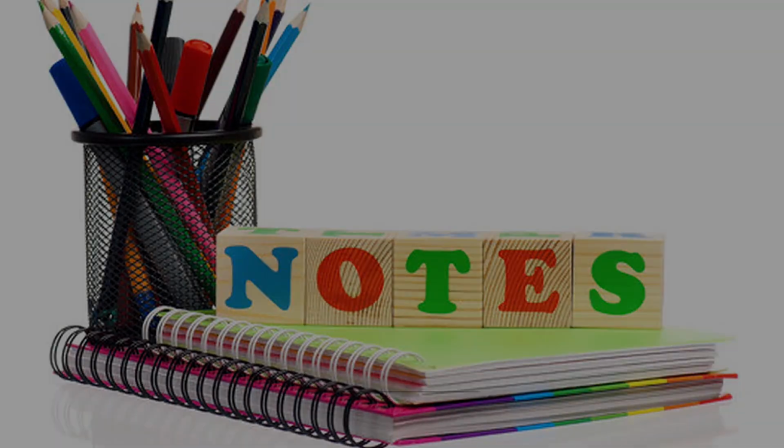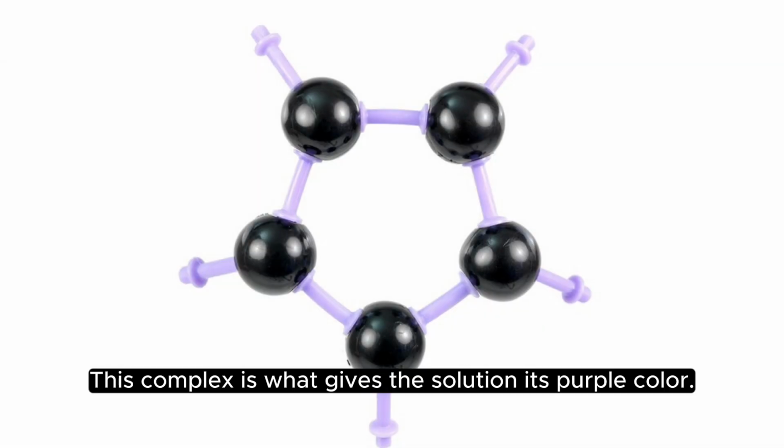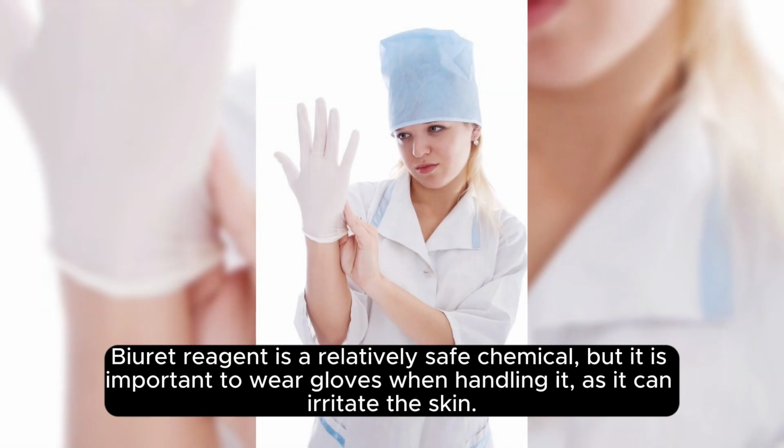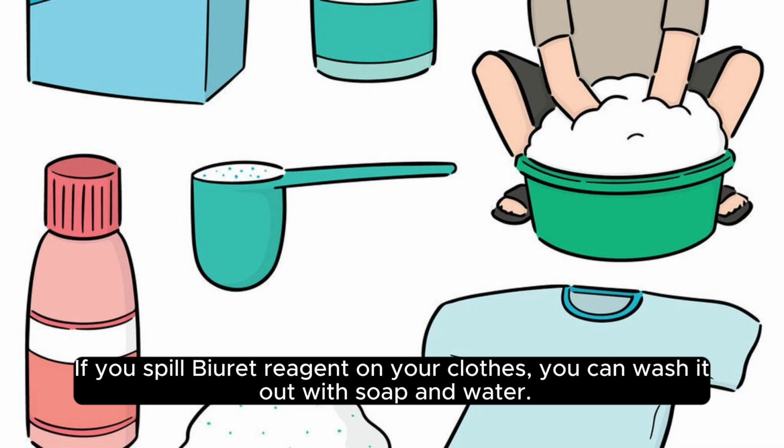Teacher's notes: biuret reagent reacts with the peptide bonds in proteins to form a purple complex. This complex is what gives the solution its purple color. Biuret reagent is a relatively safe chemical, but it is important to wear gloves when handling it, as it can irritate the skin. If you spill biuret reagent on your clothes, you can wash it out with soap and water.